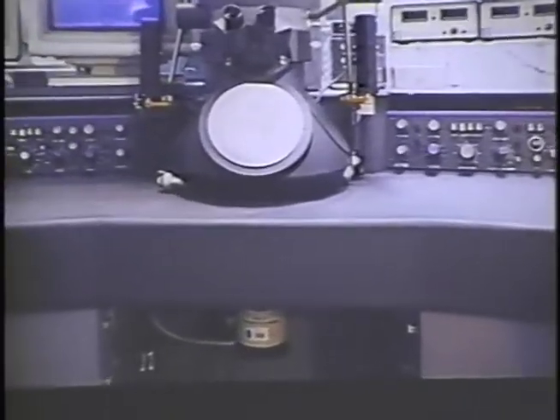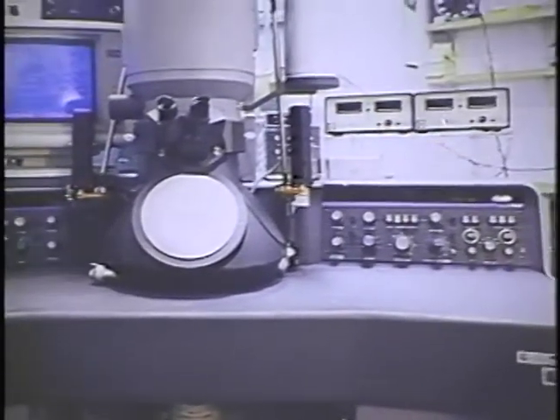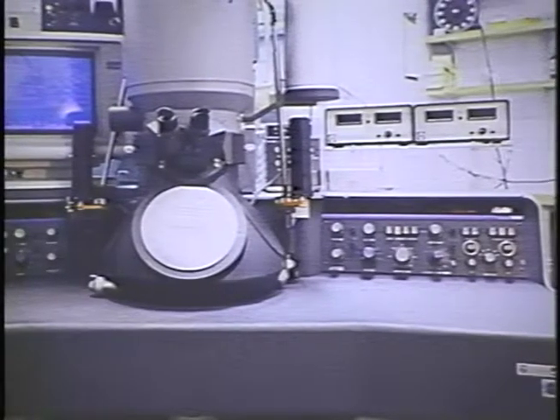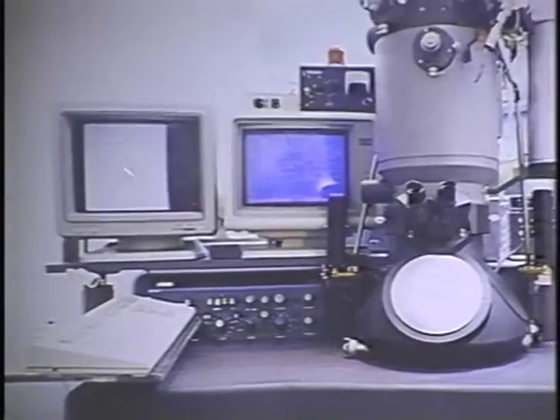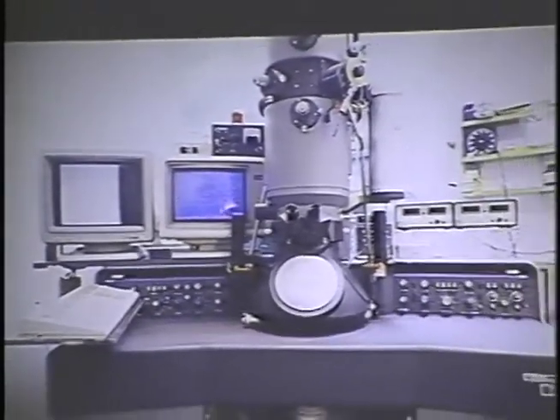And what we have here are power supply and thermal controllers for cold stages and anti-contaminators. There's one high-resolution monitor, which shows you the image, and another for computer control of all aspects of data collection.